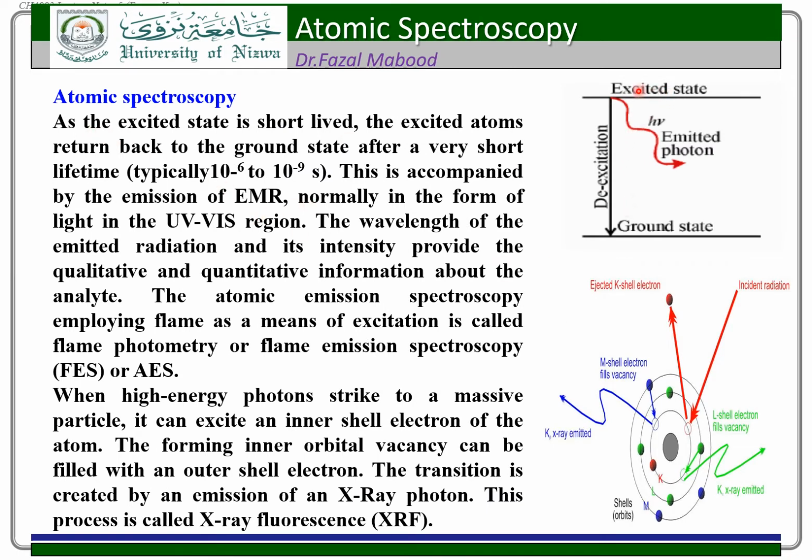And here you see again, when the electron is at the excited state, it stays for a very short time there, and it has to come back to the ground state. When it comes back to the ground state, we call this de-excitation. The amount of energy which it has at the excited state, it releases in the form of light. In de-excitation, we are getting radiation, those radiations are emitted, and this kind of spectroscopy in which we are measuring the emitted radiations is known as emission spectroscopy.